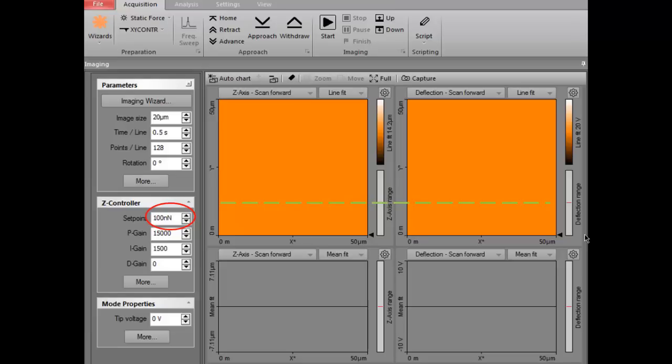When a quarter of the image is done, reduce the setpoint value by a factor of two. That means you should change it to 50 nanonewtons. Do not forget to hit the enter key when you input the value. After half of the image is done, reduce the setpoint value by a factor of two again. It should be 25 nanonewtons now. And do the same thing in the last quarter of the image. This process is called bracketing. Notice the streaks at lower setpoint values in the images.